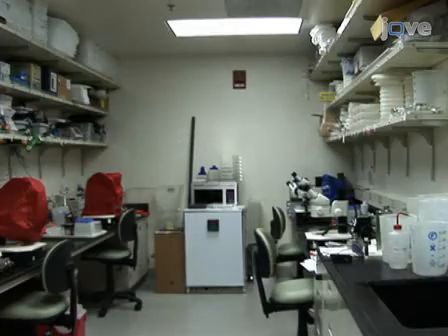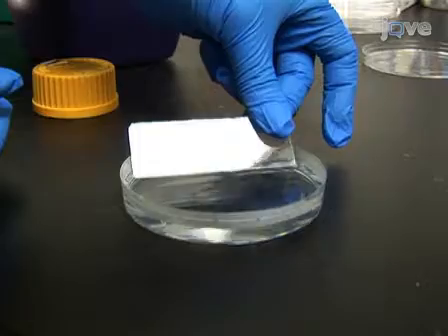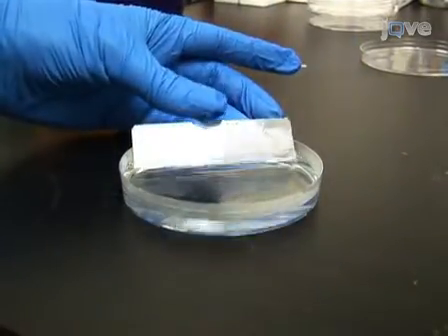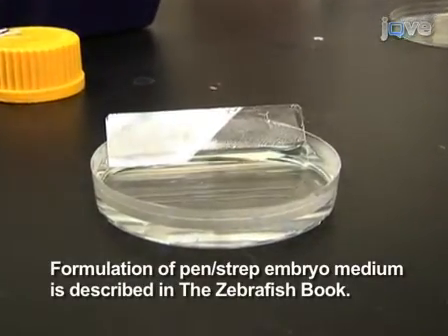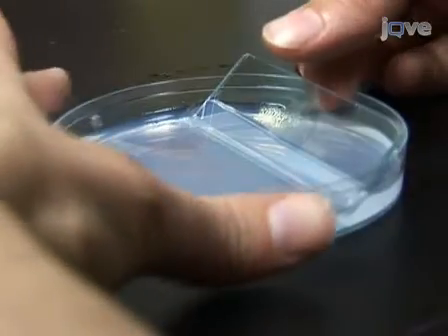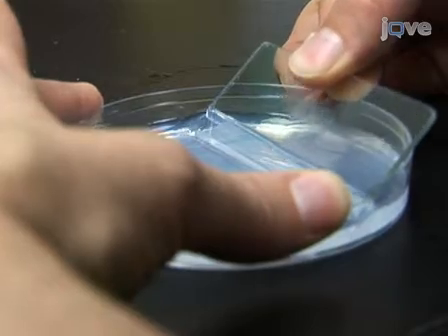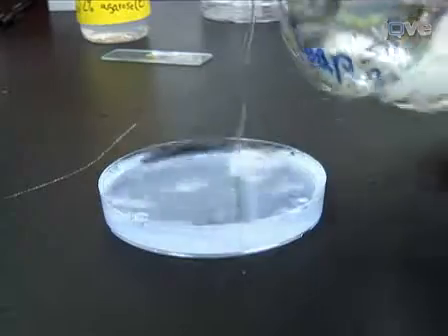Before working with the embryos, prepare an injection dish by inserting a glass slide at a 45-degree angle across the widest part of a petri dish, 3/4 full of 1.2% agarose in pen strep embryo medium. Remove the slide after the agar sets to make a beveled trough. Fill the trough with pen strep embryo medium.